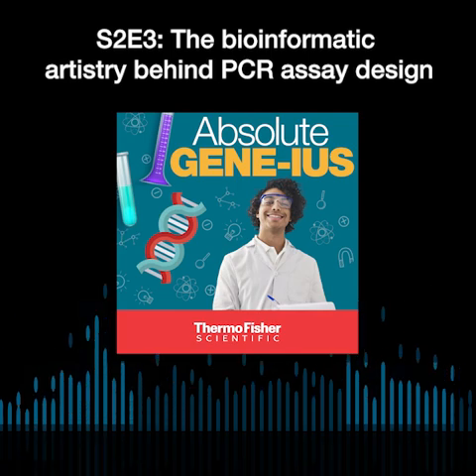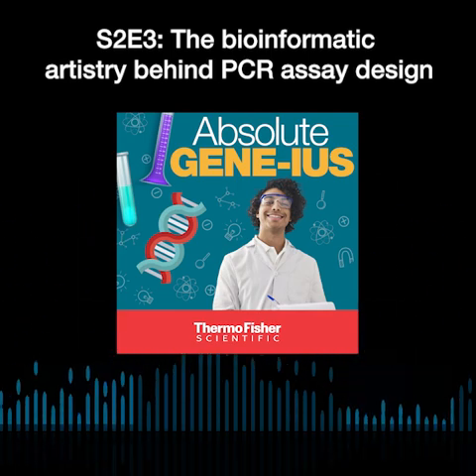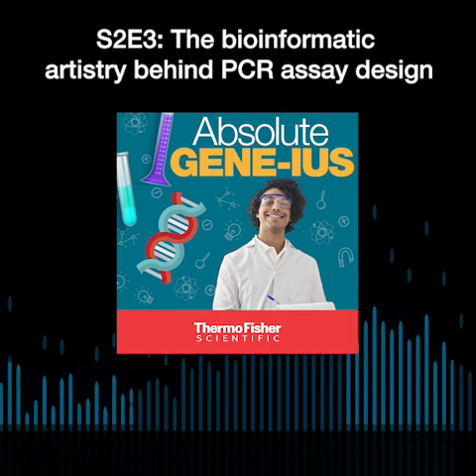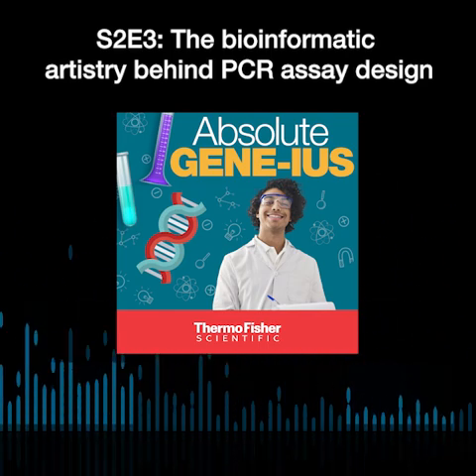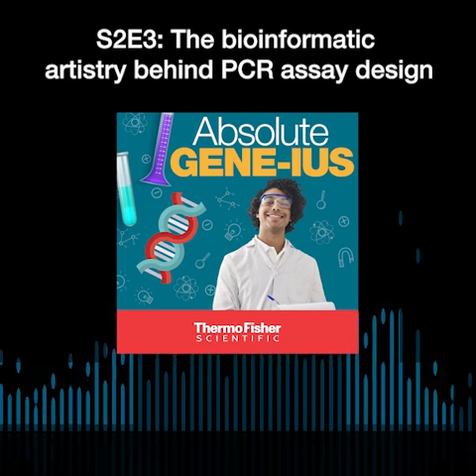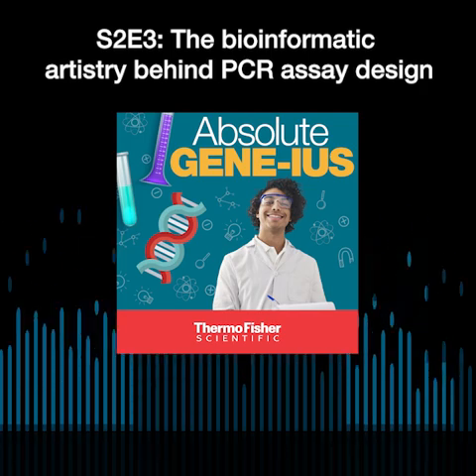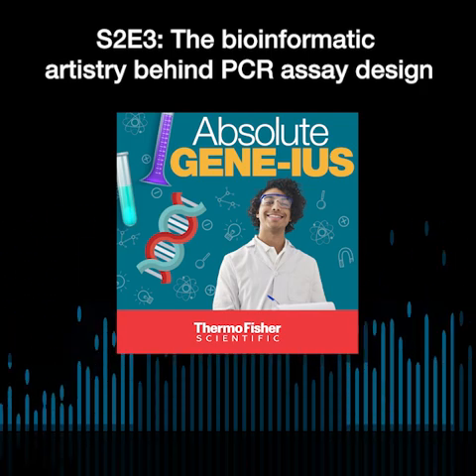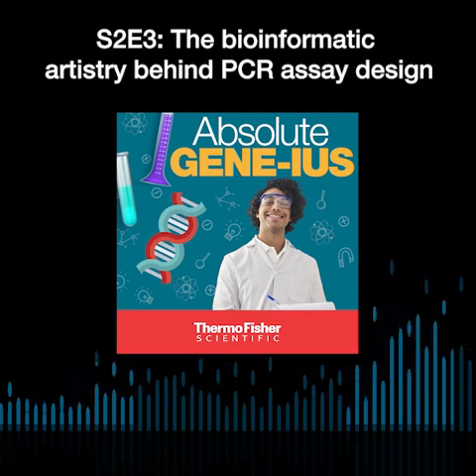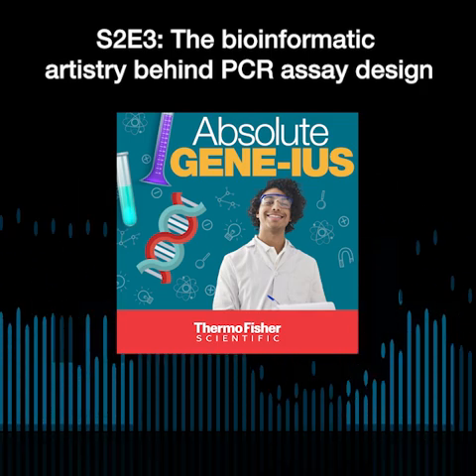When you put that in an actual sample, it can cause some complicated results and interactions. Yes, we actually launched an assay for wastewater surveillance for SARS-CoV-2, and I was on the design team for that assay. It was interesting to see, wastewater does not have a standard definition, right? Wastewater is really just a descriptive term.